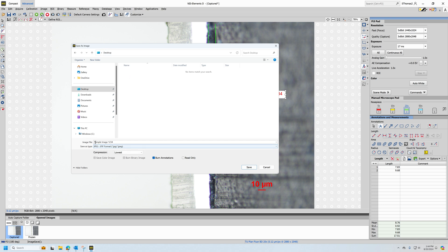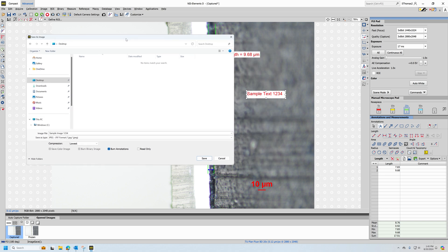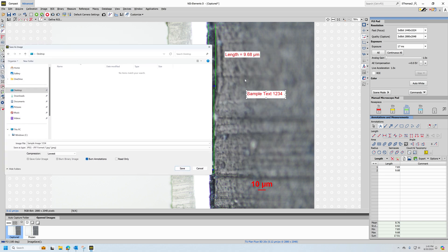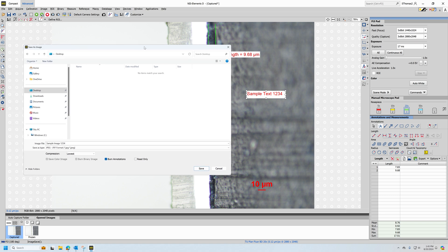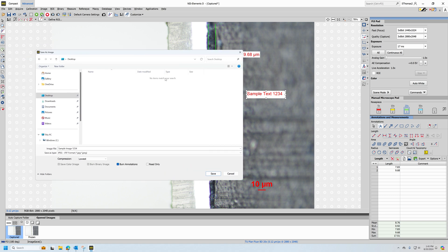I've got my location, my name, my format, perhaps leaving the compression at the lowest amount. Make sure that burn annotations is selected, so that way when the image is saved, all of my measurements and any text and my scale bar, all of that digital overlay will be saved with the image. Then I can hit save.